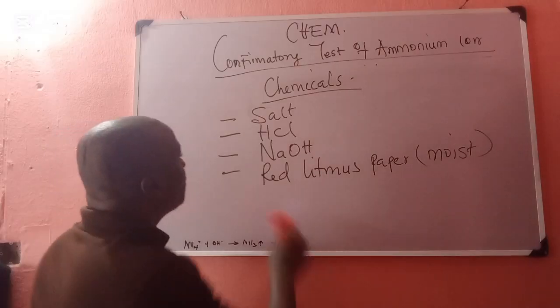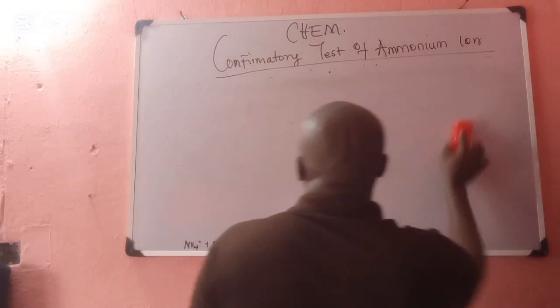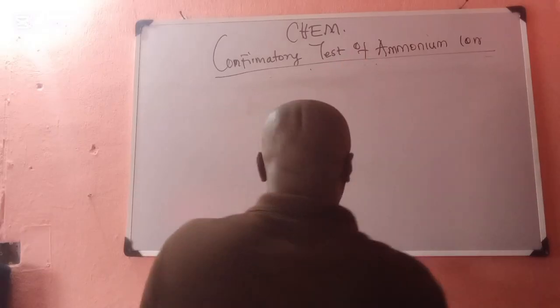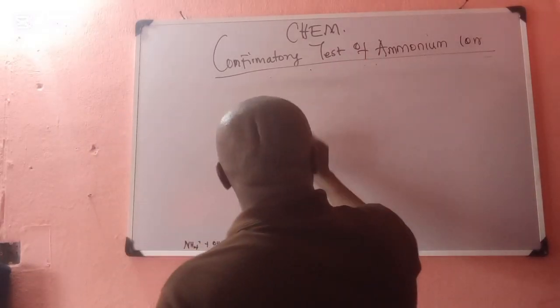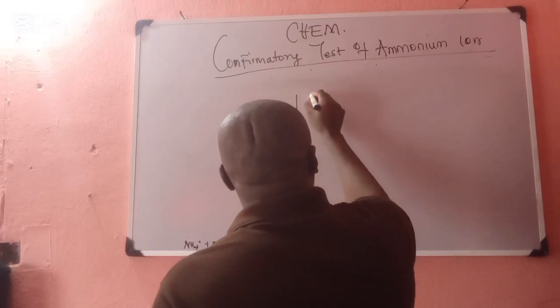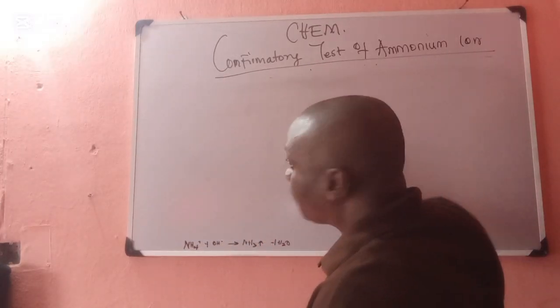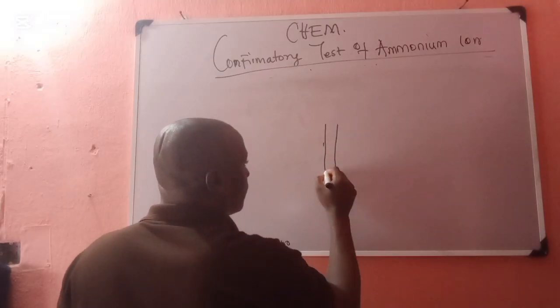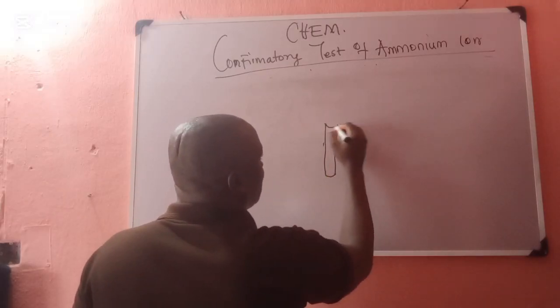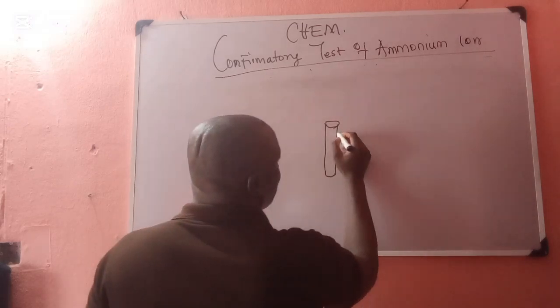So let's dive into the main analysis. The main analysis involves, from what I mentioned before, a test tube. Let's take this to be our test tube. Then we also need a test tube holder.